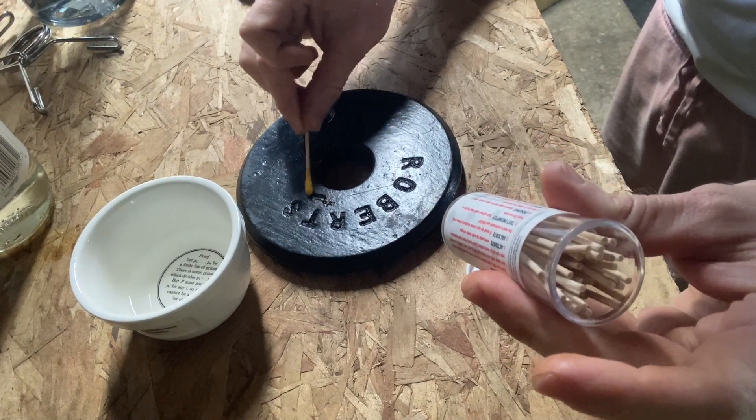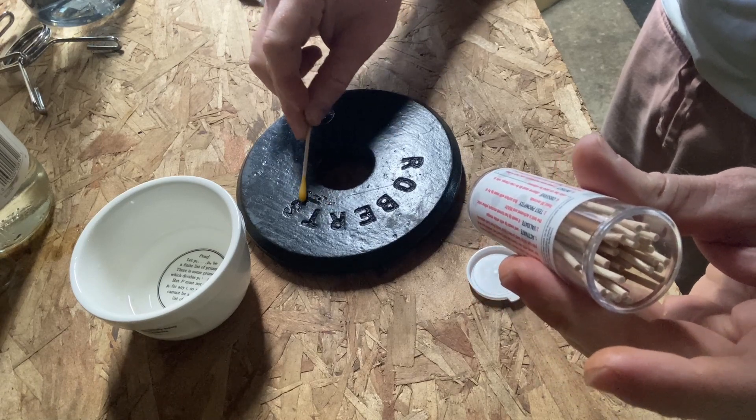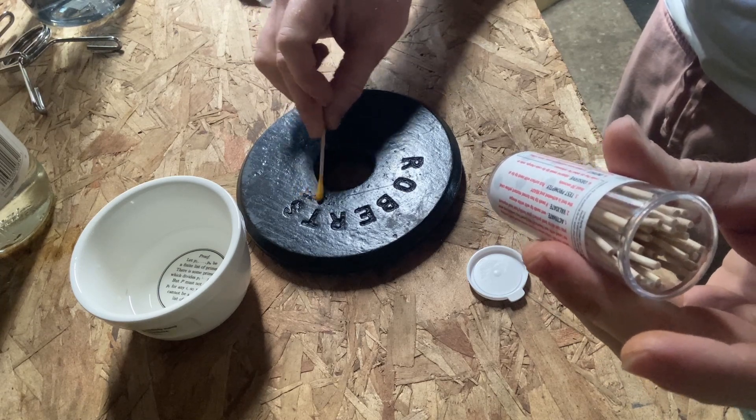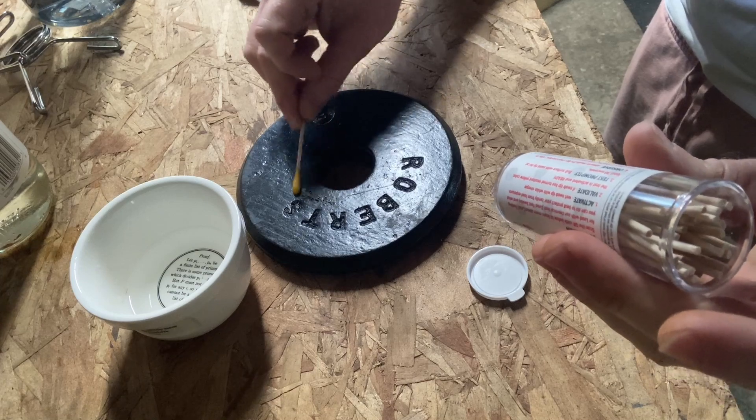It says if the swab turns red, violet, or pink, there's likely lead present. The surface may also stain pink if low levels of lead are present. So we're looking for red, violet, or pink, and we want to do this for at least 30 seconds.